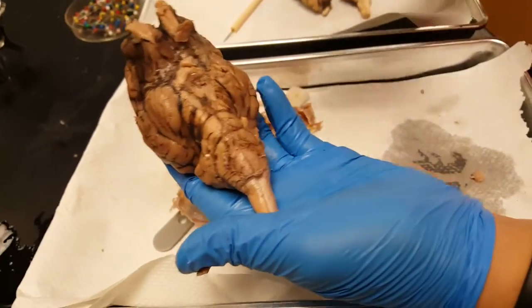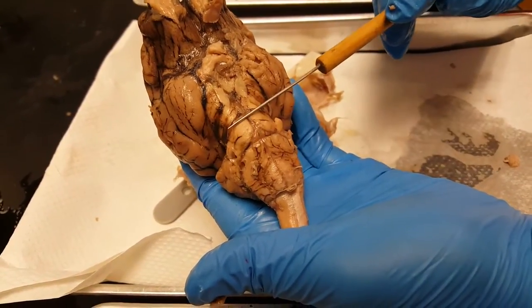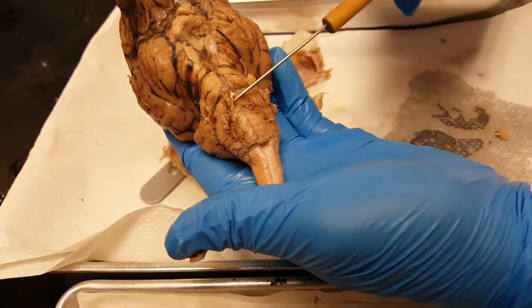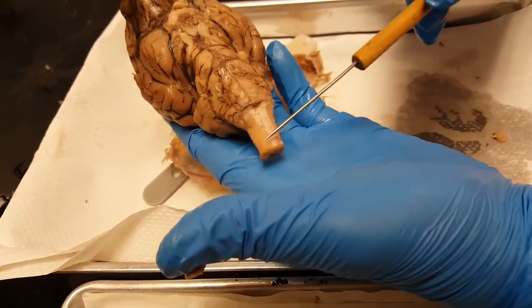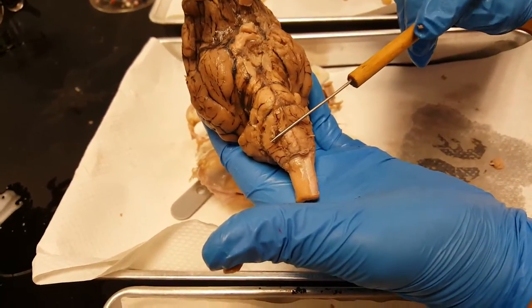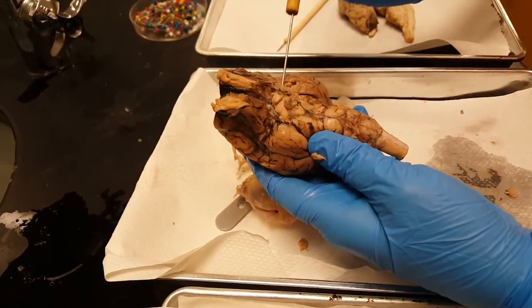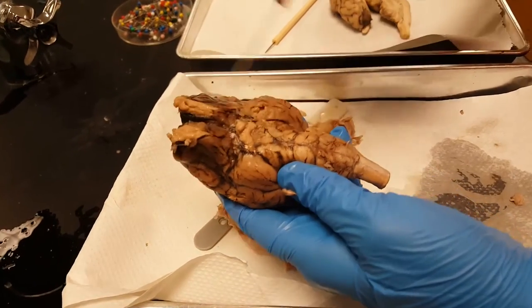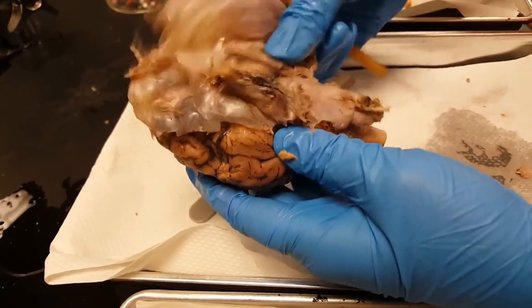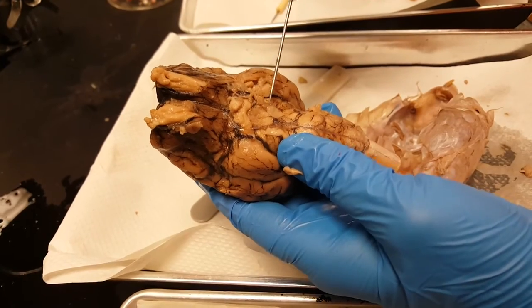Down here at the brain stem you have the midbrain. The little bump there is the pons, and behind it is the medulla. Notice it has a different texture than the spinal cord. So: midbrain, pons, medulla oblongata, spinal cord. The place where the pituitary was attached — right there — is called the pituitary stalk, also known as the infundibulum.